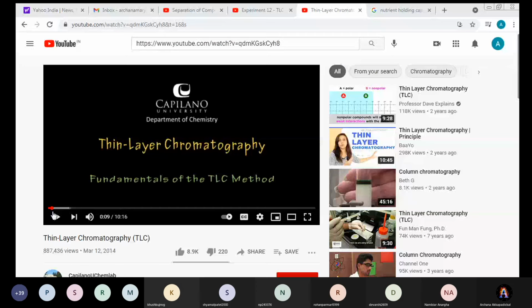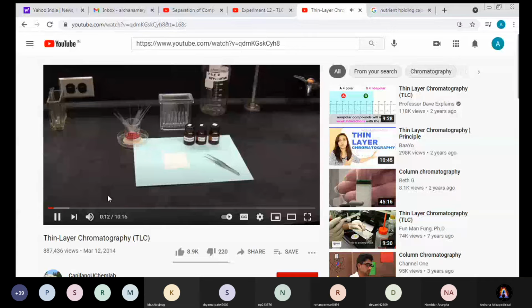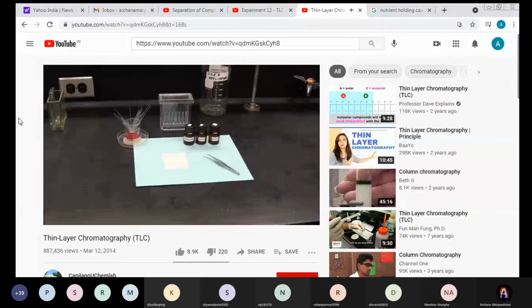Thin layer chromatography, TLC, is a method used for rapid qualitative analysis, where components in a mixture can be separated and identified. This video is focused on the general method.